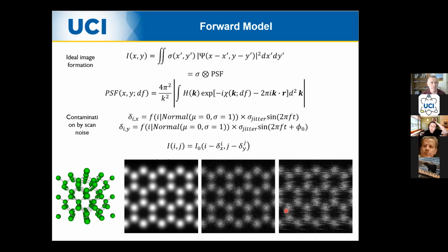right? So here's a way to actually simulate or generate realistic TEM images, right? So in the TEM, we're looking at those atomic scale images. And as you can see here, this is an image without any noise, where you have these atomic columns that are aligned. Typically, we're doing counting experiments. That's where you have Poisson noise.